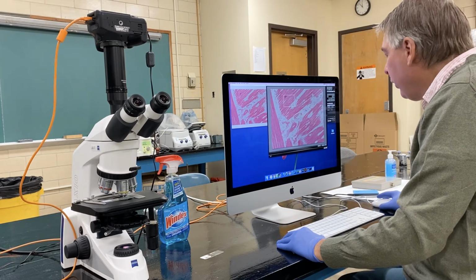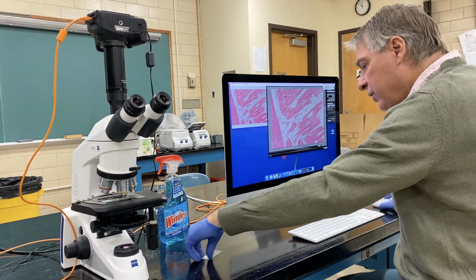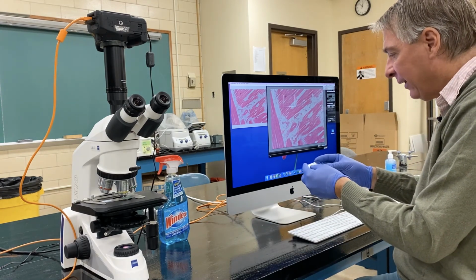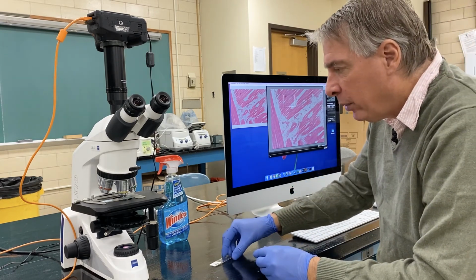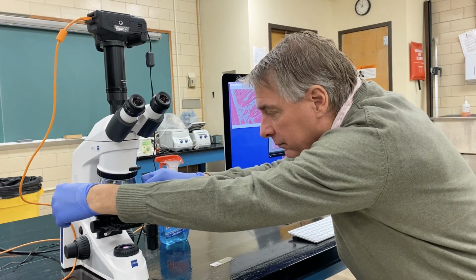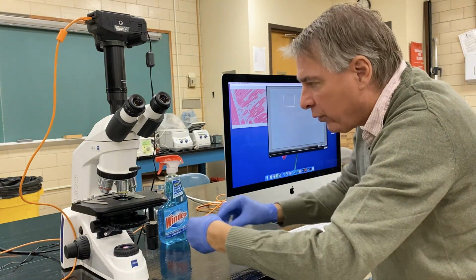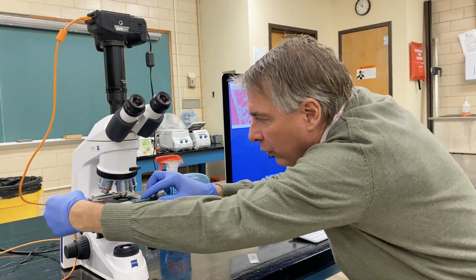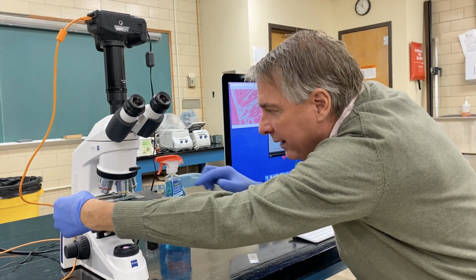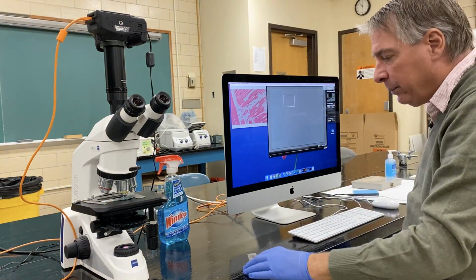Okay, now I'm going to show you how to make a scale bar on your image. And in order to do that, you need to use something called a micrometer slide, which is a small ruler that's been printed on the glass slide itself. And I'm going to remove the sample that's on the stage, and I'm going to replace it by the micrometer slide by moving the spring lever over and placing the slide into the holder and then returning the lever to hold the slide in place.